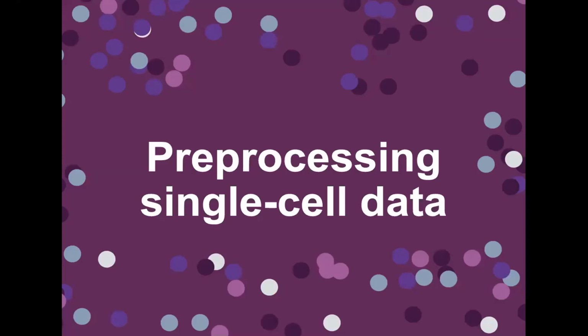Okay, so the next topic for the workshop is that we're going to talk a little about how to actually pre-process and analyze some single cell data. This is machine learning for single cell analysis, and a lot of the things that we're going to be doing involve single cell RNA sequencing data. The first half of the notebooks today are going to address some of the things Smita was talking about in terms of graph construction. And then the second half, we're going to focus on actually loading a single cell data set and getting into some of the nitty gritty of doing pre-processing.